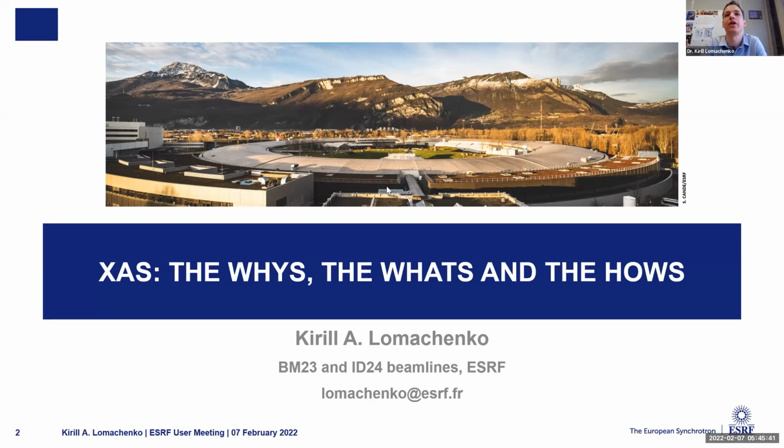In case of K edges, you probe mostly P states. It's 1s to P. In case of L edges, you start from the P orbital and you probe S and D.